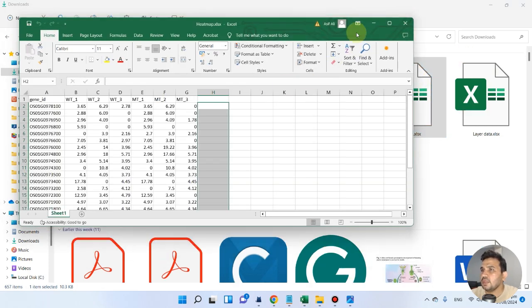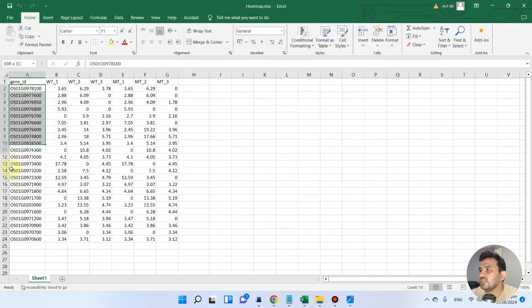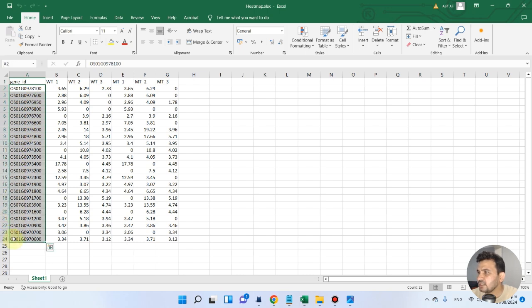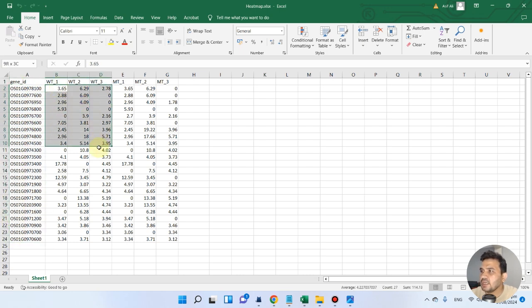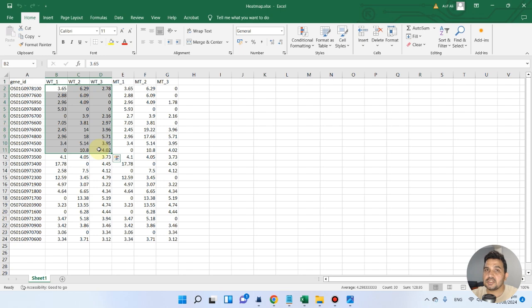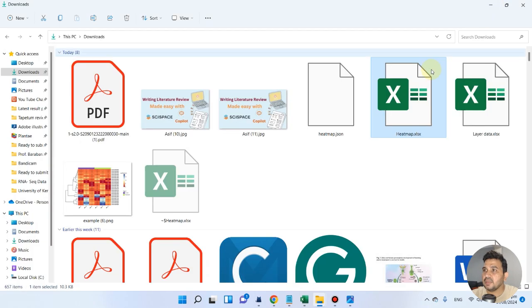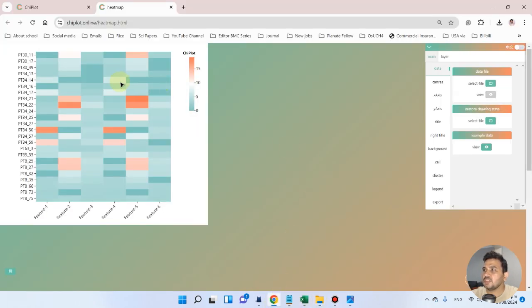Here you can see we have a data file with gene IDs, three replicates of wild type, and three replicates of mutant type. This data can be any gene expression data — it can be simple FPKM values, average gene expression, or fold change values. Once you have prepared your data, save the file in this format.